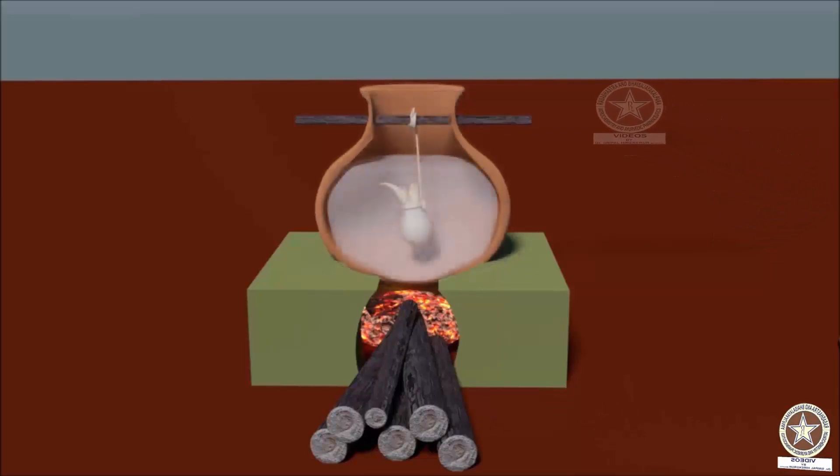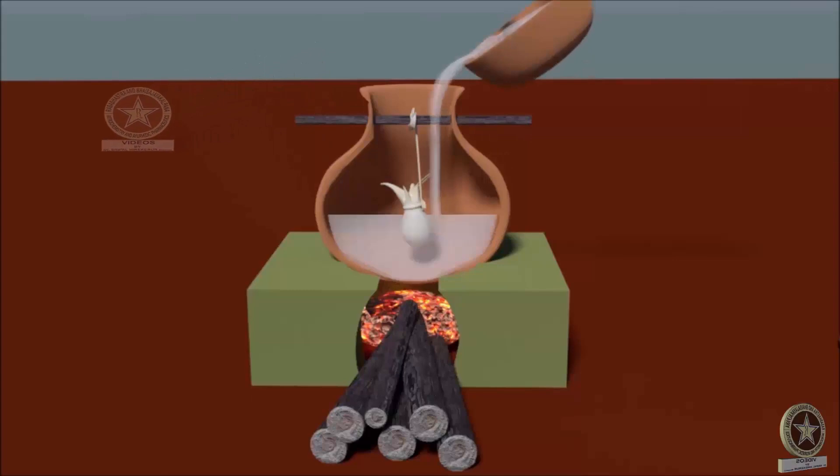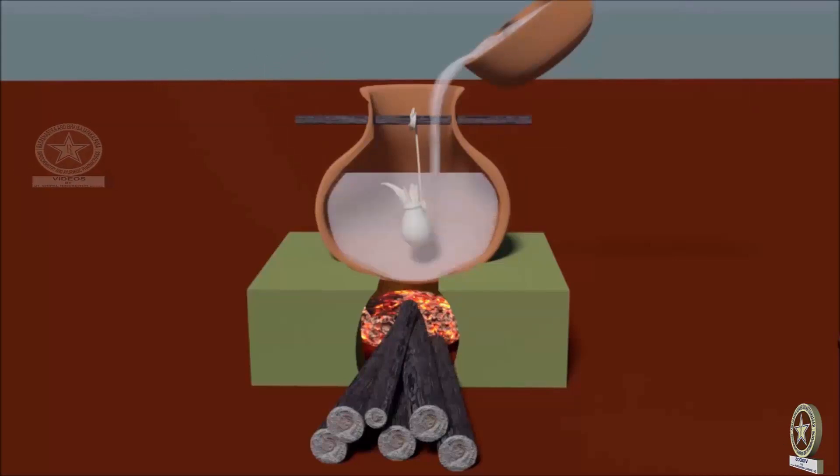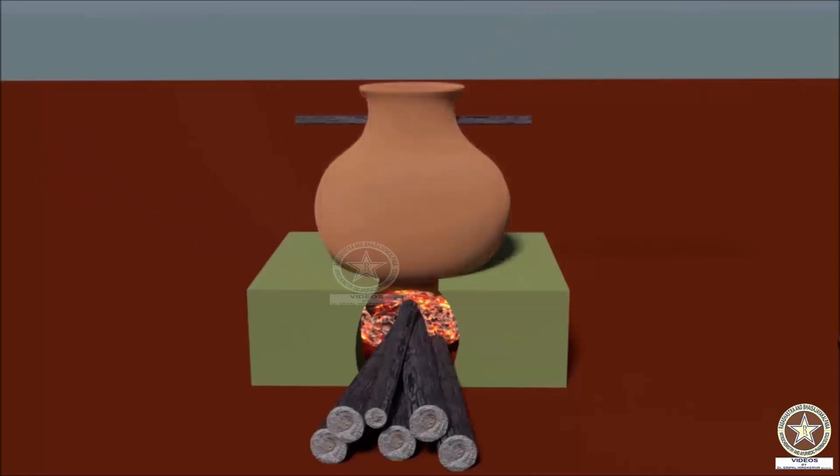After some time of heating, the liquid media in the pot evaporates, which needs to be refilled. The process of heating must be carried out up to the duration specified — here it is 1 yama, that is 3 hours.